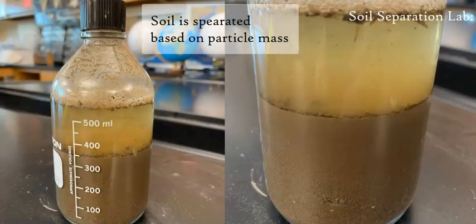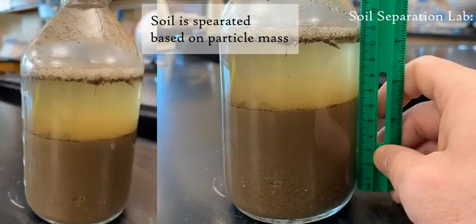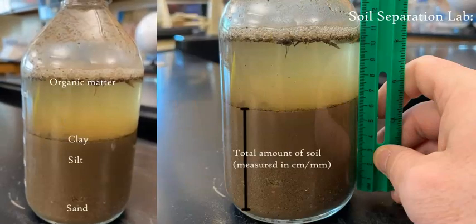So this is the same jar, just the next day, so about 12 hours later. Give enough time for the gravity to do its thing in the glass with the particles, and you'll see there is somewhat of a clear separation between the bottom sediment, which is going to be sand, the middle area, which will be the silt, and then there's a tiny small fraction of clay, which is the light brown at the very top of our soil sample. And then you have the mixture of water where it has a solution of little bits of soil within that solution and organic matter on the top.